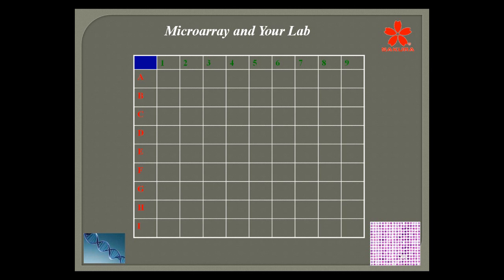Now, here's the grid pattern. It's very simple, and as I said, they can be either squares or they can be ovals, and so you can place numbers, letters, it doesn't matter which, so that you can identify the area. But you'll need to have a reference point, which I'll mention again, in some place or corner, so that you'll have some beginning point that you'll be able to reference each time. So if you see A here, that whole row will be A, and the numbers at the top will correspond with the square, so that you have a way to identify what you're actually constructing.